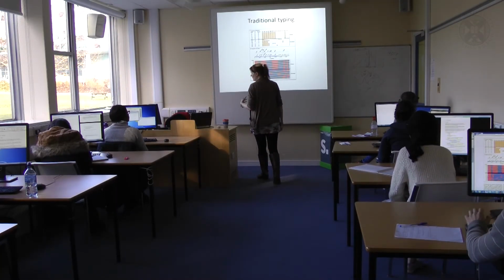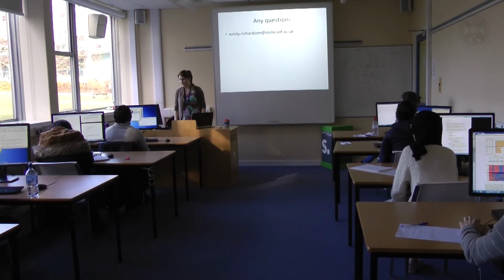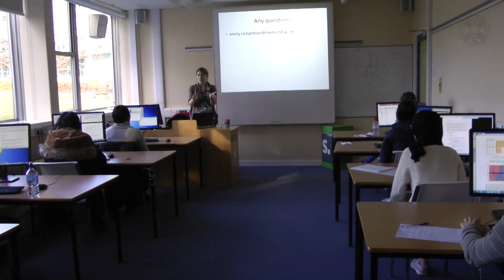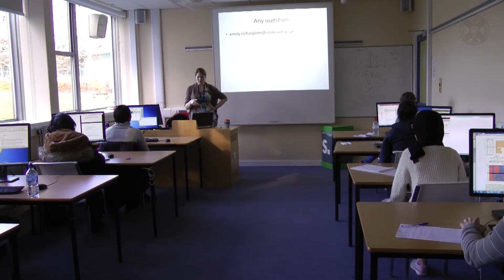There is a final exercise, but that's like an extra credit exercise, if you like. And that's for looking at whole genome data and actually visualizing it. So if you want to look at the assembly of the data that you've made, you can actually look at it and compare them. The software that you need is something called Brig. It's all in there. You should be able to download it.